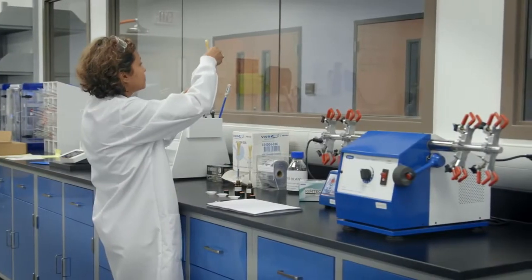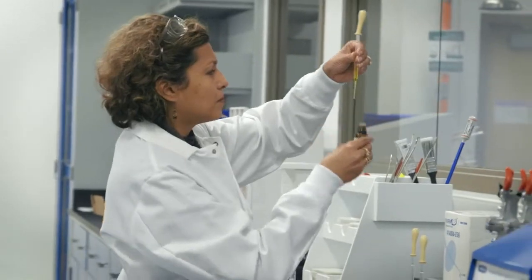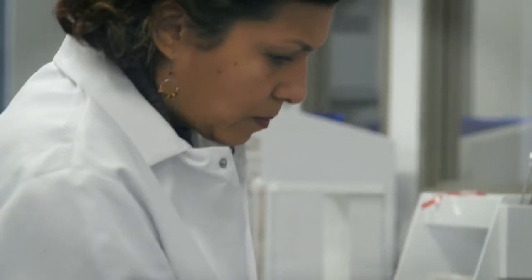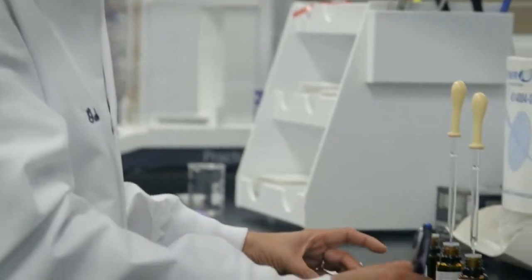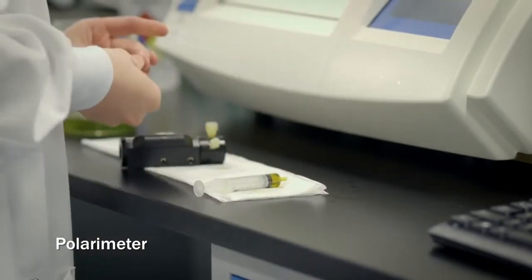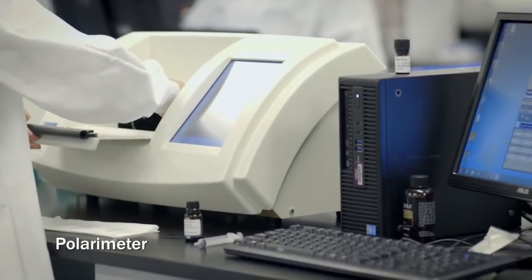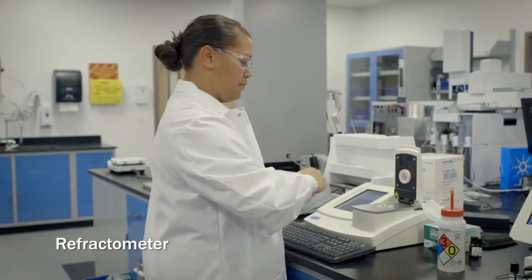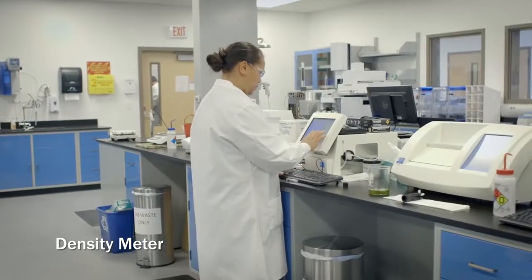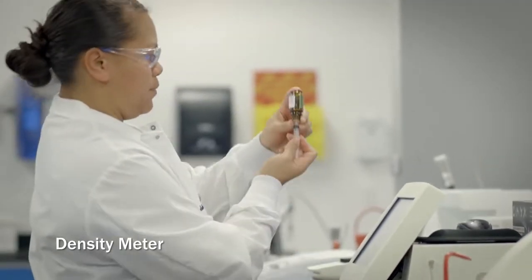After each oil has been identified by GCMS, further identified by FTIR, we actually test the physical parameters of each oil. And then the physical testing is a compilation of quite a few different tests. Optical rotation, in which we use a polarimeter, and that tests the chirality of the molecule. Sometimes chiral molecules can be missed on GCMS, so it's another verification. A refractive index, which is done by a refractometer, because each essential oil twists light in a different way. And then the specific gravity, which basically measures the difference in weight between water and the oil.